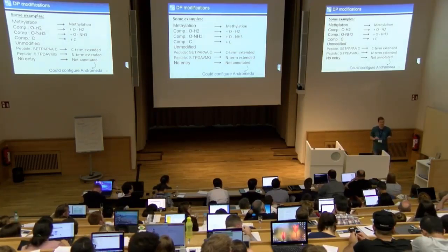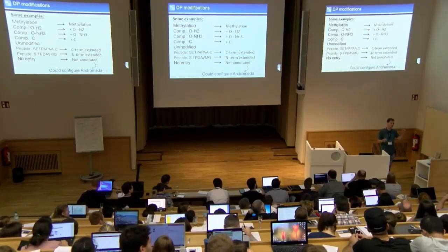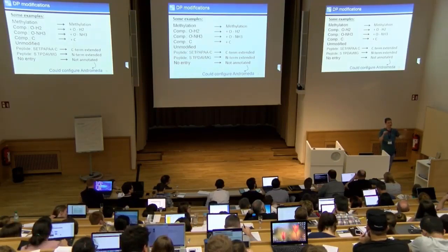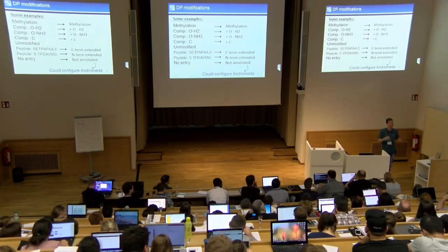For the dependent peptide, you know the mass from the MS1 feature. Now you look into your identified spectra, which also have MS1 features, and you just compare the masses of the two, and you immediately get the delta mass. Okay, so it's not scanning, it's just going through the list and calculating it pairwise.